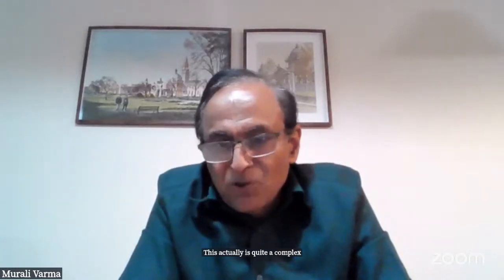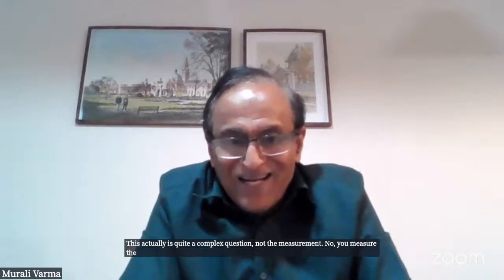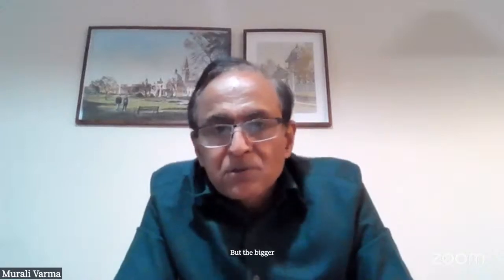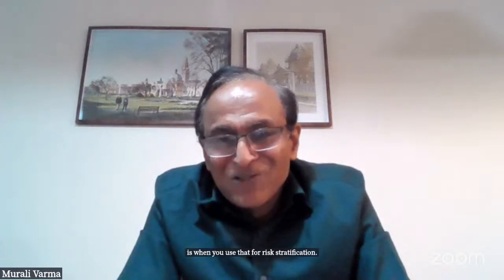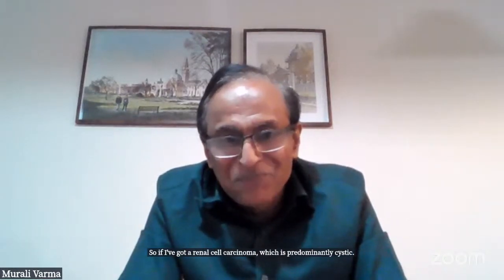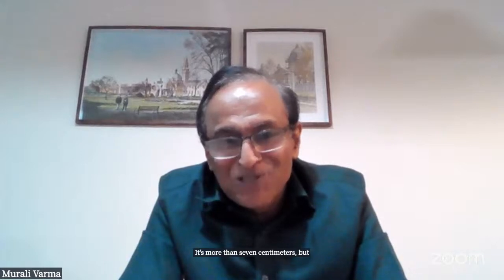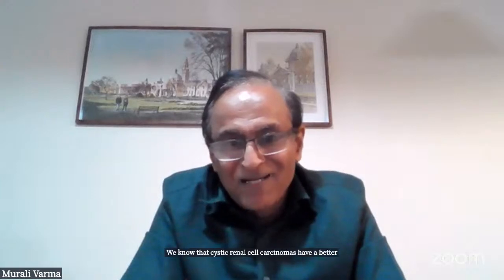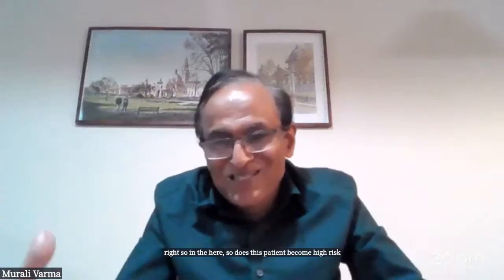Wow, this actually is quite a complex question, not the measurement. No, you measure the cystic tumor as you would any other tumor, isn't it? So you measure it. But the bigger problem with these cystic tumors is when you use that for stratification. If I've got a renal cell carcinoma which is predominantly cystic, it's more than 7 centimeters, but it's more than 7 centimeters because it's full of fluid, right? We know that cystic renal cell carcinomas have a better prognosis, right? So does this patient become high risk because of the size of the tumor?